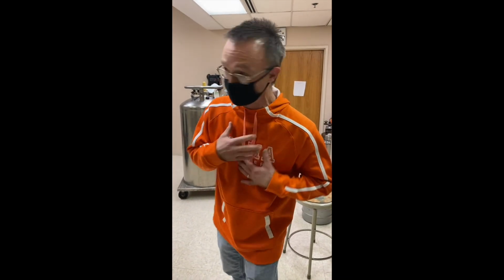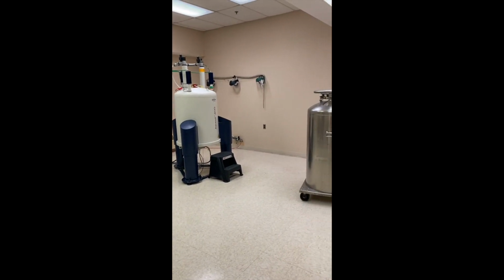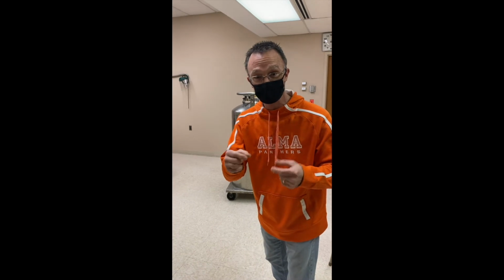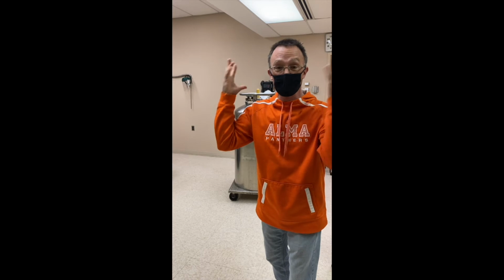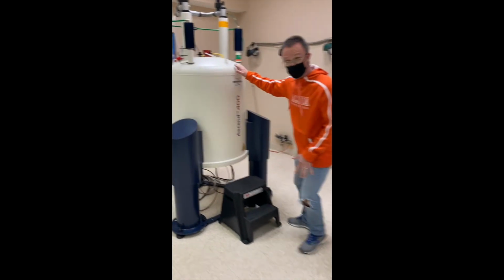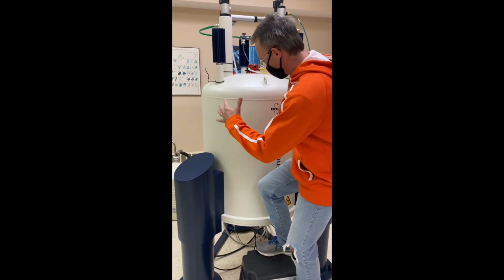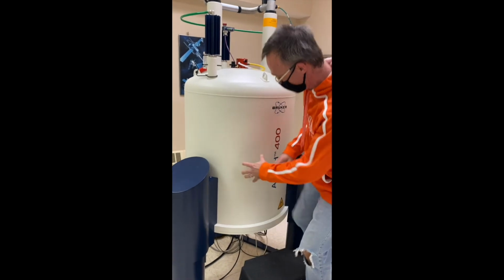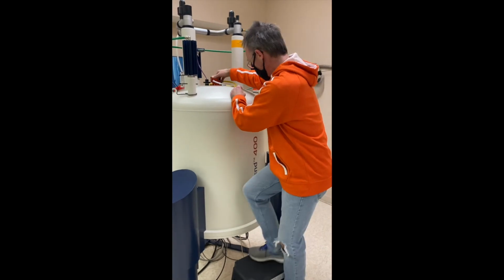This is probably the coolest instrument if you're an organic chemist or any synthetic chemist at all, like I am. This right here is about a $500,000 magnet. And it can actually interact with the nucleus of different atoms, causing them to spin, and the computer measures an absorption, and bang, we can determine the structure of the molecule. Come on a little closer. So it's a superconducting magnet. It actually has liquid helium and liquid nitrogen around it, this big giant dewar. The magnet on the inside is only about this big. And so right inside here is where we put our chemical samples.